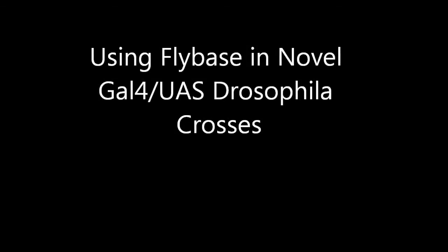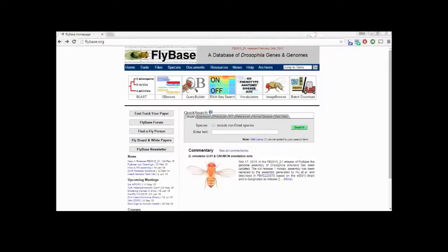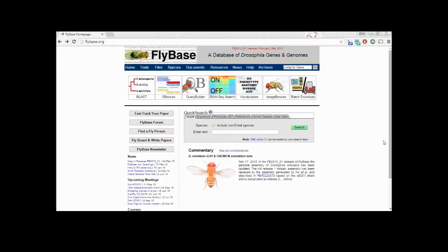When creating novel Gal4 UAS crosses, the FlyBase database can be a valuable resource to help you determine what to expect. I will help you find several pieces of data to let you characterize the genes that your driver and promoter are associated with.